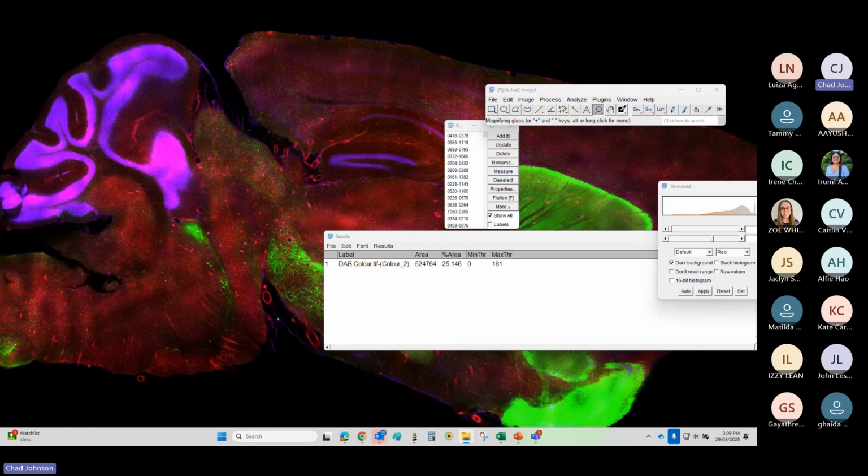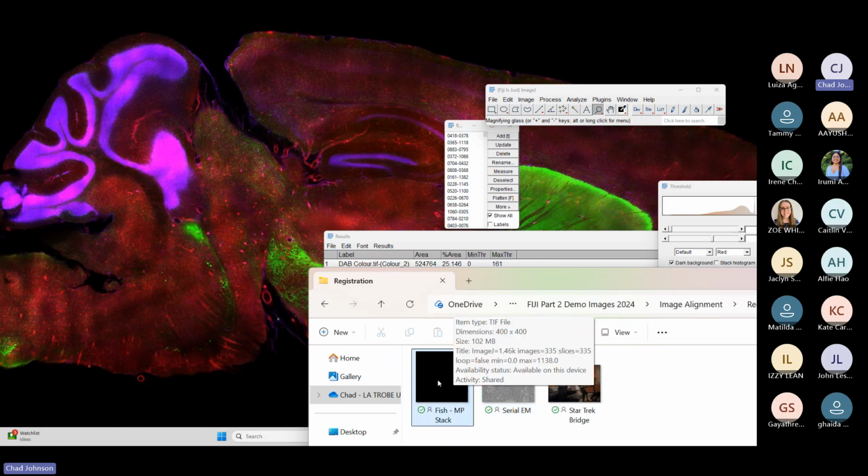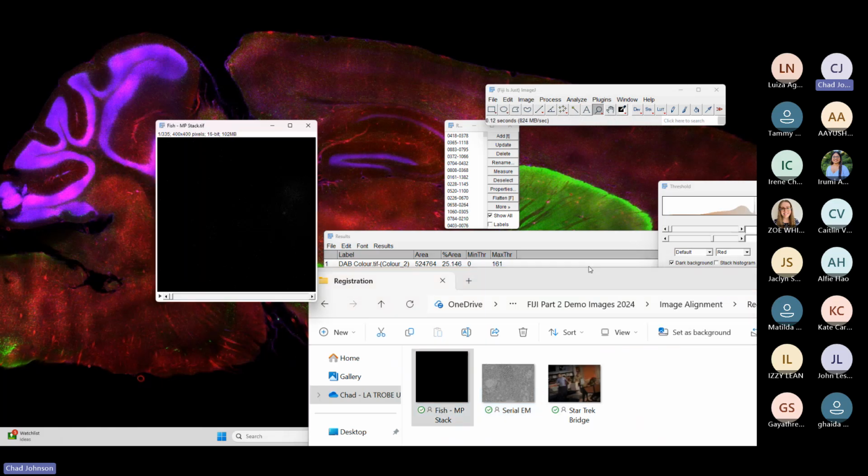So I'm just going to go find where those actually are. Okay, uploading. Those should now be available. So we're going to grab the fish multi-photon stack, and we're just going to load that in.